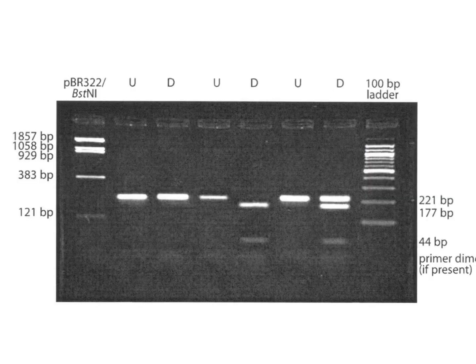This is an actual picture of an electrophoresis gel. DNA was loaded into these wells, so these are the wells, you can just barely see them. Electricity caused the DNA to move from the top to the bottom, and the DNA was separated by size. So every band represents a group of DNA of the same size. The further away they move from the well, the shorter they are.